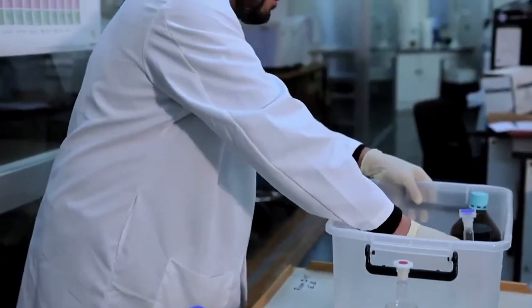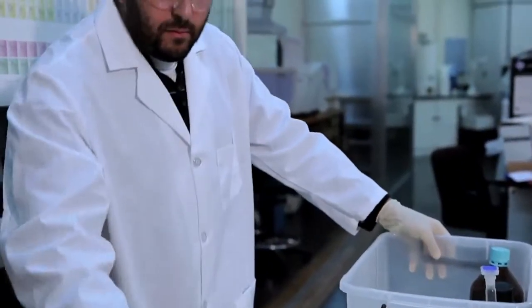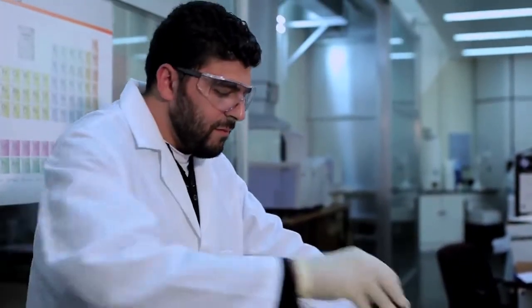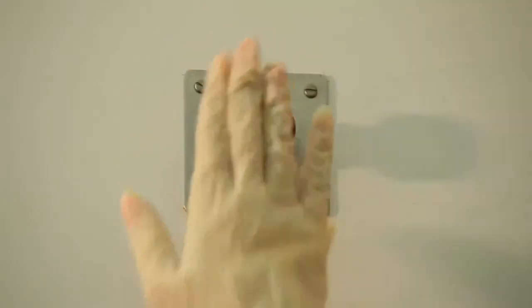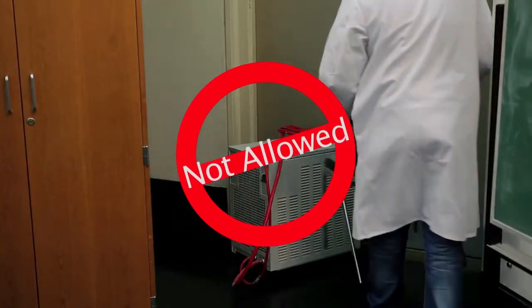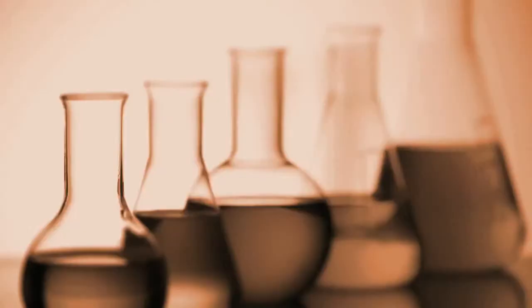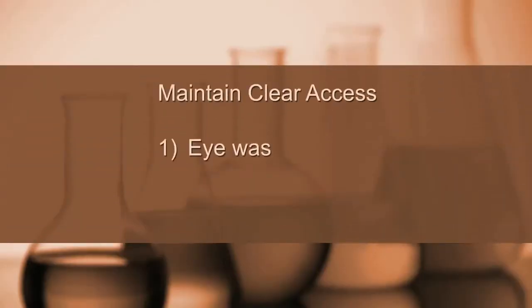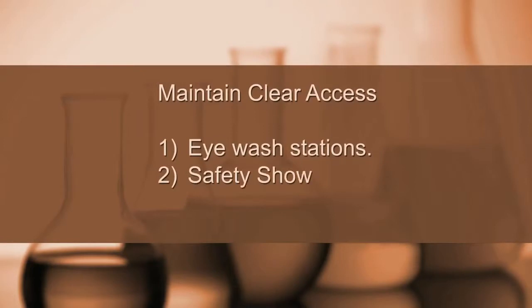Store or dispose of chemicals not being used, especially flammable or combustible liquids or reactive materials. Emergency personnel must have clear access to electrical breakers and panels. Maintain clear access to emergency equipment, such as eyewash stations, safety showers and fire alarm pull stations.